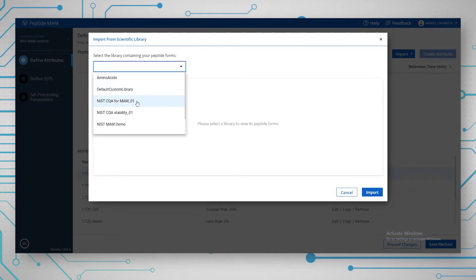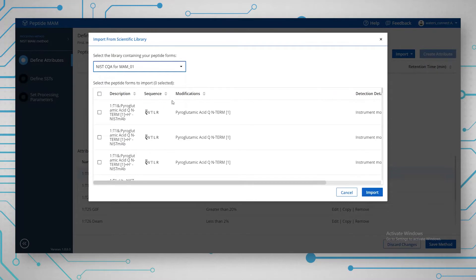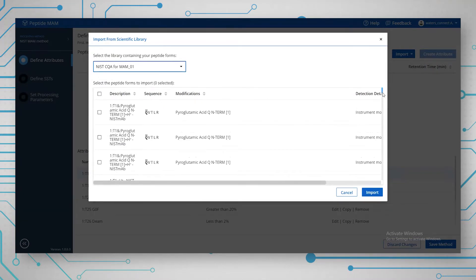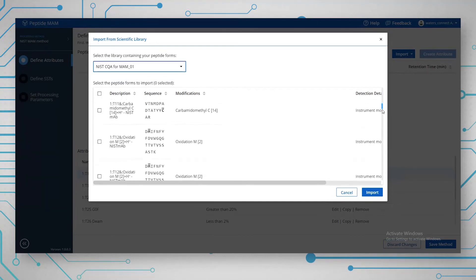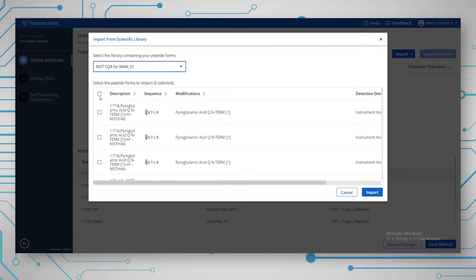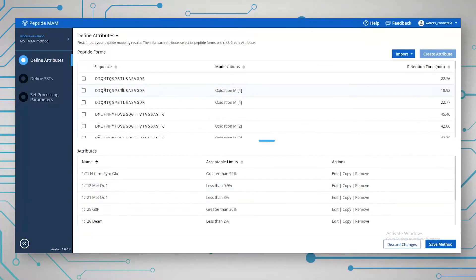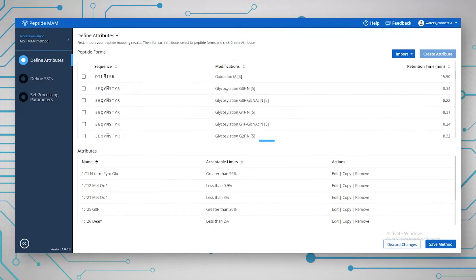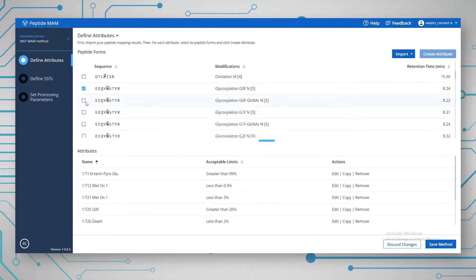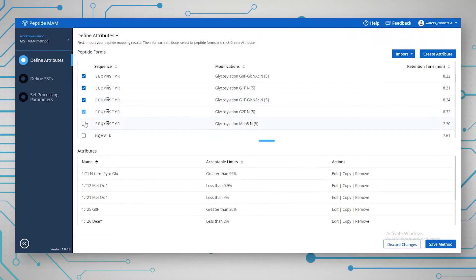We're going to use the scientific library because we've done everything in Unify in this example. Bringing in this library, we can see we have lots of peptides that have been brought in. We can now select the whole list and bring them all in — though we're not actually bringing them into the method just yet, just into this table. From here, we will go on and select what we want to use to create an attribute. I'm going to select all the different instances of the glycosylated peptide on the NIST antibody, selecting all instances and saying 'create an attribute'.